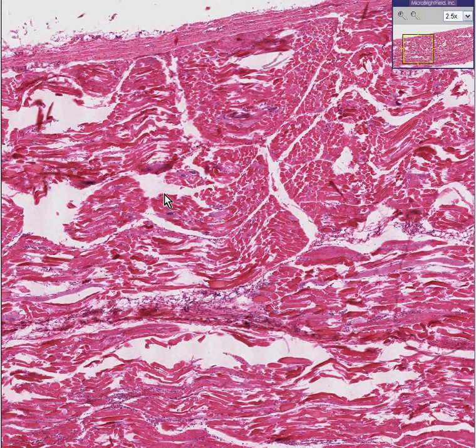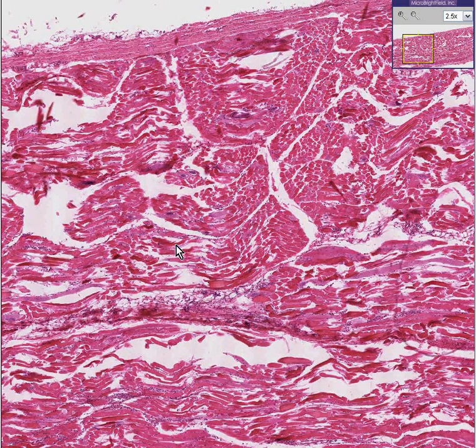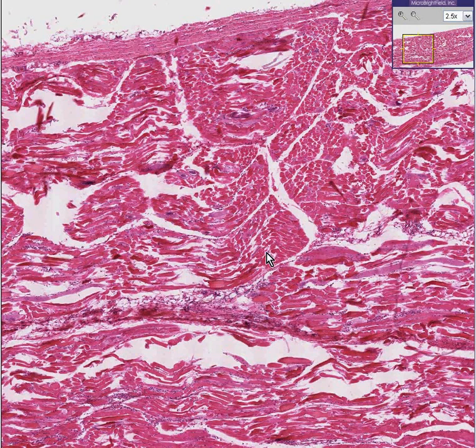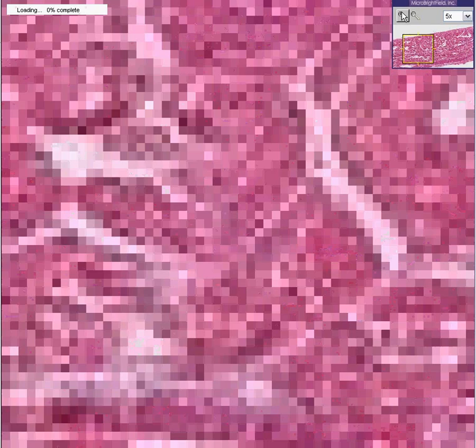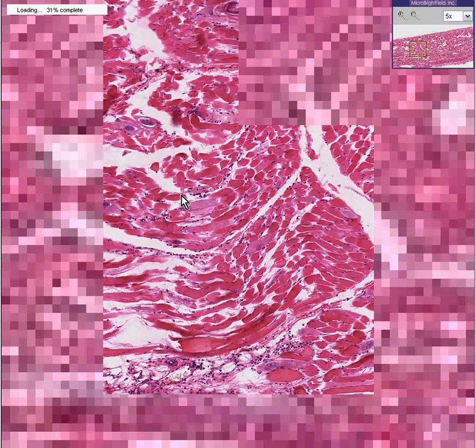Notice when you look at the skeletal muscle from a further perspective, you can see there are little areas scattered throughout that are kind of disrupting the overall normal beauty of the arrangement of the striated muscle fibers.